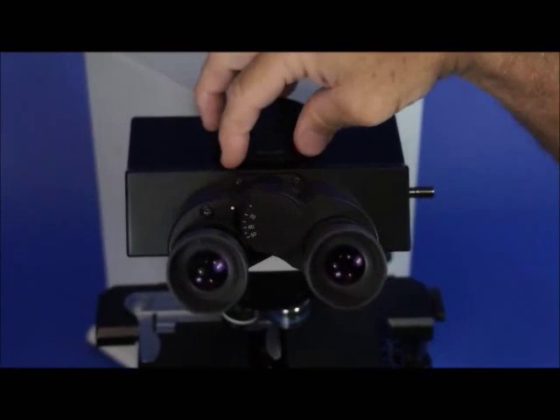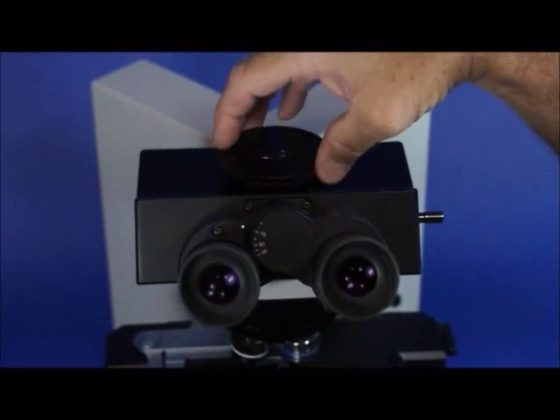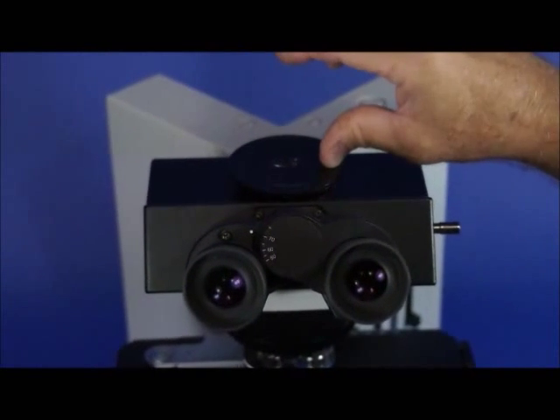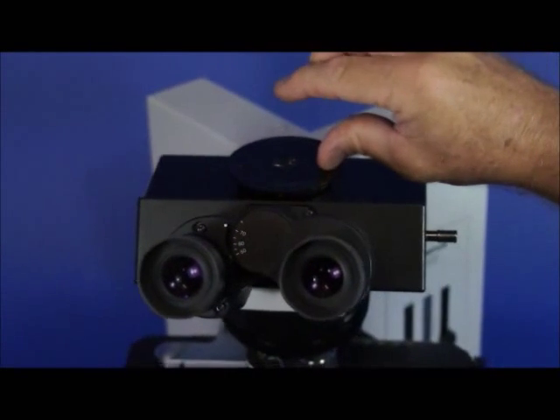We have a trinocular port on the very top, which allows you to put an adapter here, whether it's for a video camera or a digital camera.